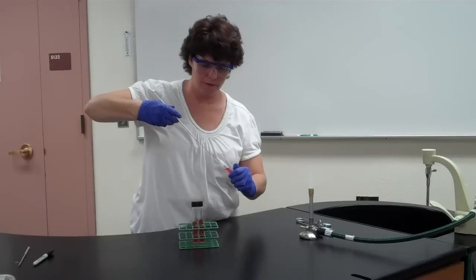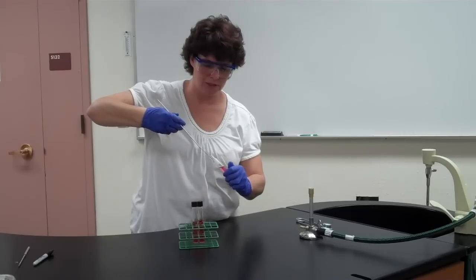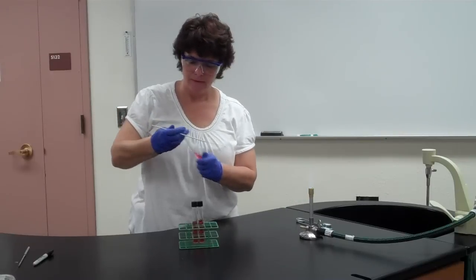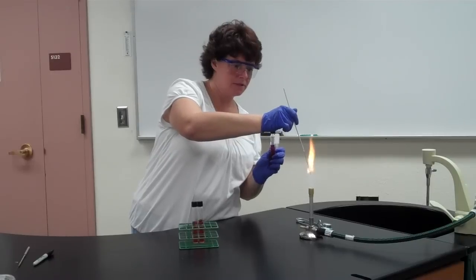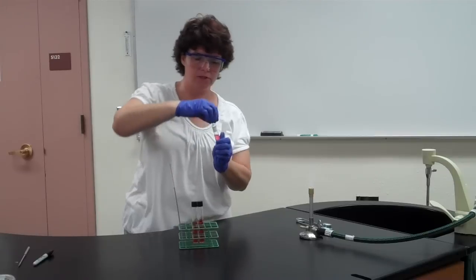Make sure it's cooled off enough that you don't see a sizzle. Just dip it in there. You don't need to shake it too much because you don't want to actually add to the bubble. Slightly get that on there. Sterilize my loop. And now I want to close this.